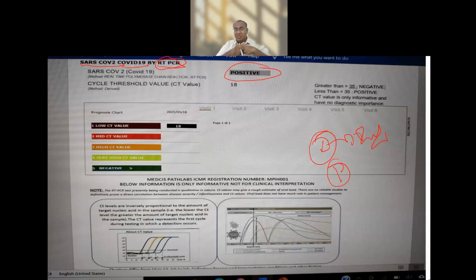Now, I wanted to know whether the line of treatment which has been given is decreasing the load of the virus in the body or not. To find that out, I need to depend upon certain molecular techniques, what I call a polymerase chain reaction. These molecular techniques play a very important role in medicine, either in diagnostic medicine or in prognostic medicine. So the diagnosis and prognosis.